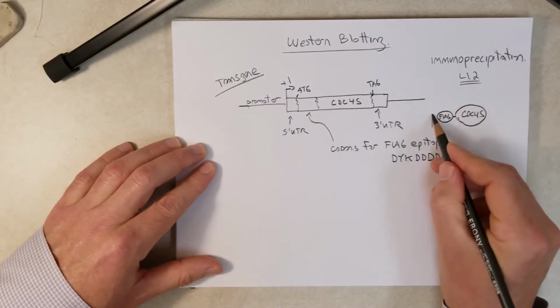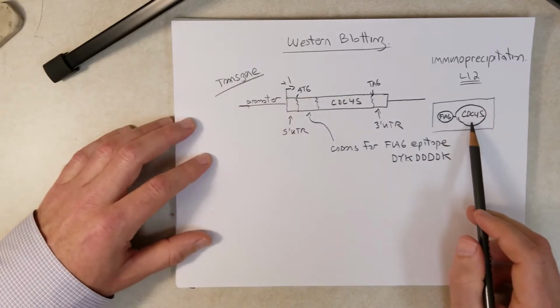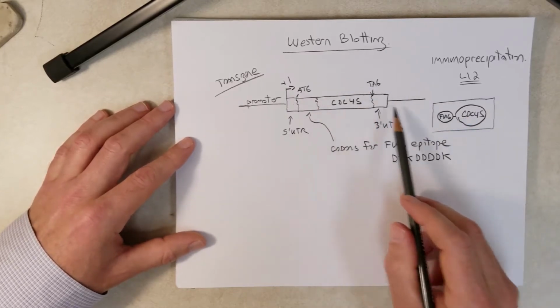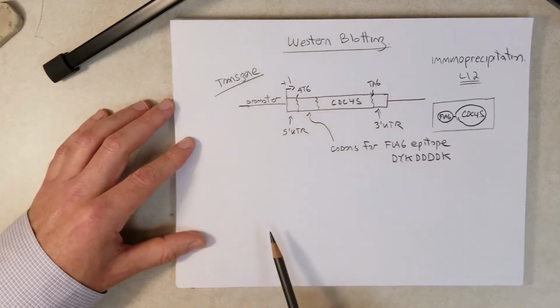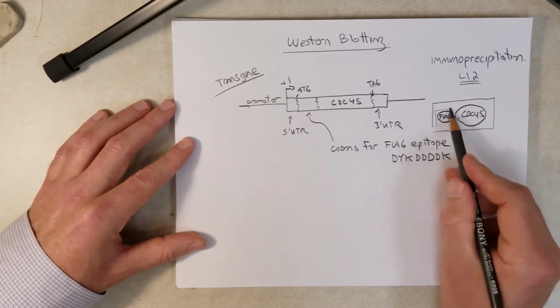Now this is our fusion protein, and we talked about this because we were interested in how scientists study DNA replication and initiation of replication. They have to purify all these proteins. And this is an easy way to do it, tagging the protein with an epitope like the flag epitope. Then they can use certain procedures that focus on purifying the protein by focusing on this.